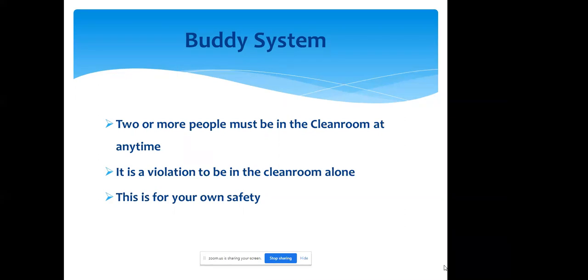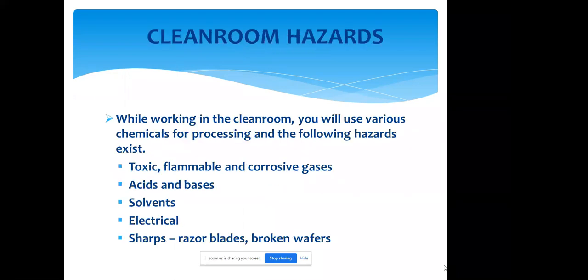If somebody tells you, oh, it's okay, you can be in the clean room by yourself, you really need to think hard about that. You can slip, trip, and fall, knock your head out, and nobody would know what happened to you. So always make sure you have a buddy. There are so many hazards in the clean room. I'm not trying to scare anybody. I'm just trying to give you the information so you don't just walk in without knowing.